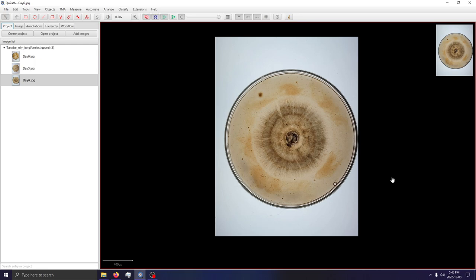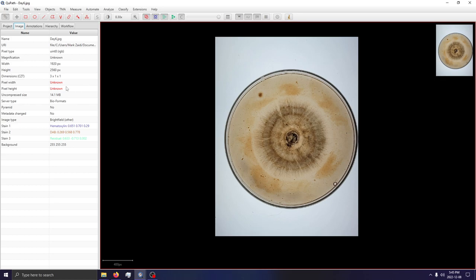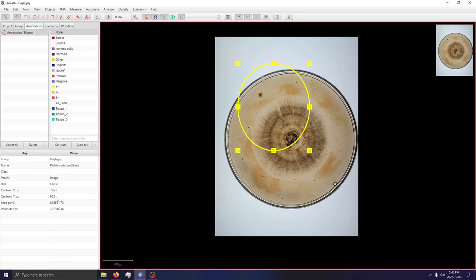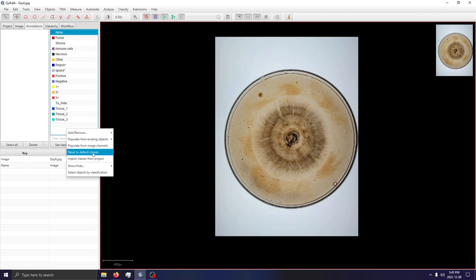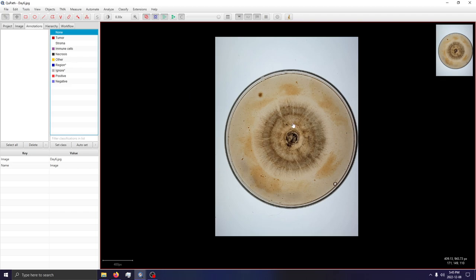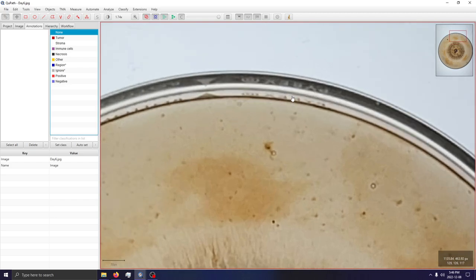Since we're discussing area and will likely want to export measurements in microns or millimeters squared, the first thing we need to do is set the resolution. When you put a picture on a forum, I believe it strips the resolution metadata, or it wasn't originally provided. You can see pixel width and pixel height are currently unknown. Any annotation drawn will report area in pixels squared, but I'd rather use a metric area-based measurement, and for that we need to specify resolution metadata. Looking at the sample, you can make out the letters P-Y-R-E-X — this appears to be borosilicate glass.